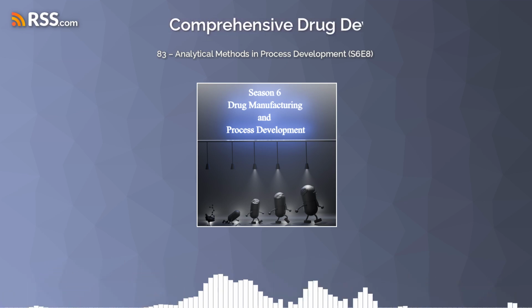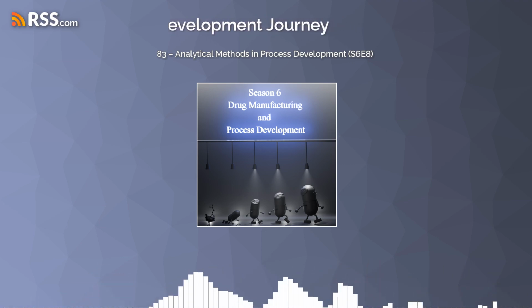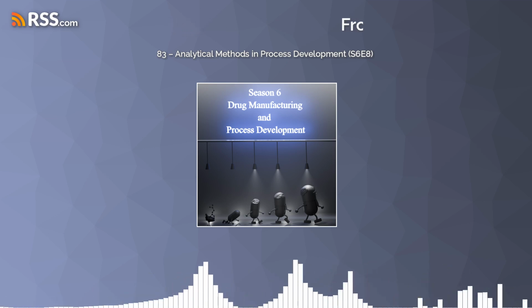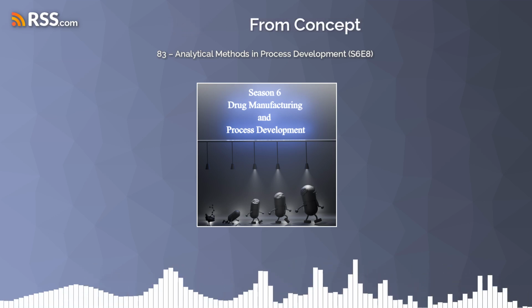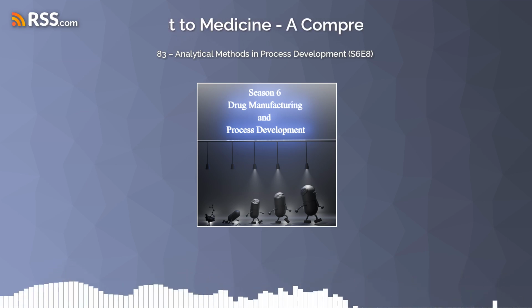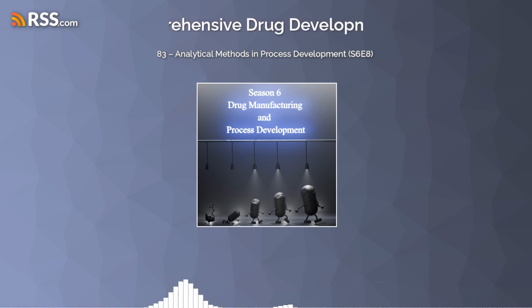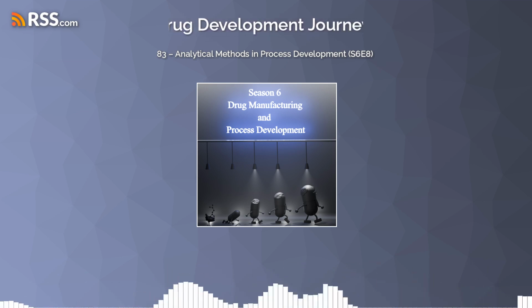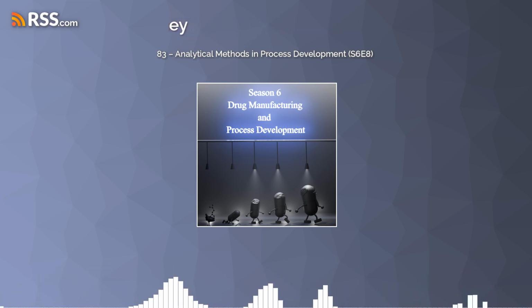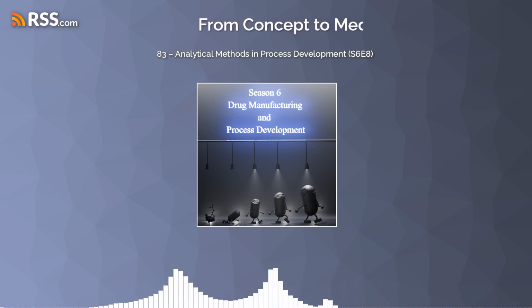So imagine you're taking samples from your reaction, let's say every hour. By running each of those samples through the HPLC, you can actually watch as the starting material peaks get smaller over time as they're being consumed, and then the product peak gets larger. You can also identify and measure any impurity peaks that might pop up, so this really gives you a quantitative picture of how that reaction is progressing. And whether you're getting the desired outcome in terms of yield, how much impurity, is it clean?